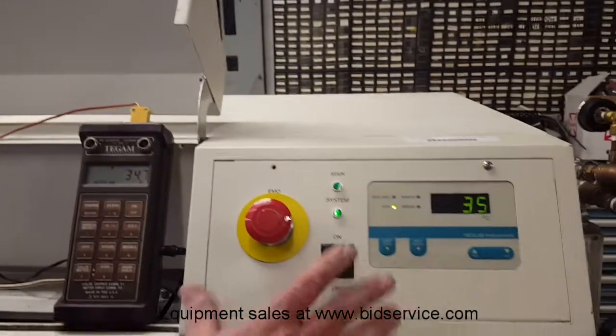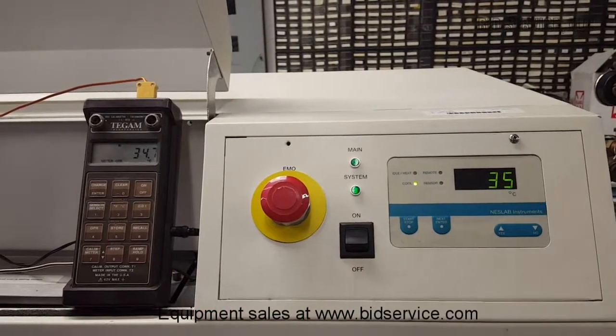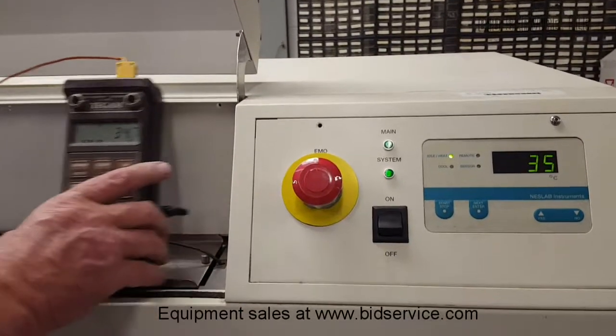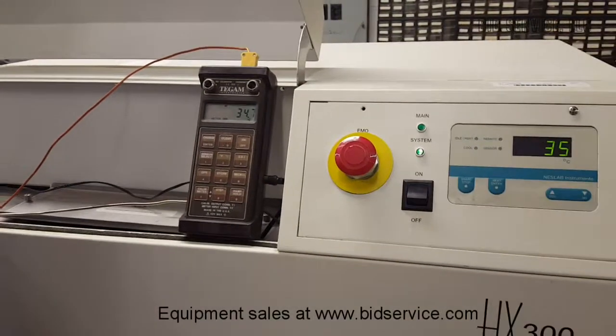Right now you can see I've got it set for 35 degrees. The range on this unit is 5 degrees to 35 degrees C. I have a thermocouple into this water tank which is filled here, and you can see that we are at 34.7 C.